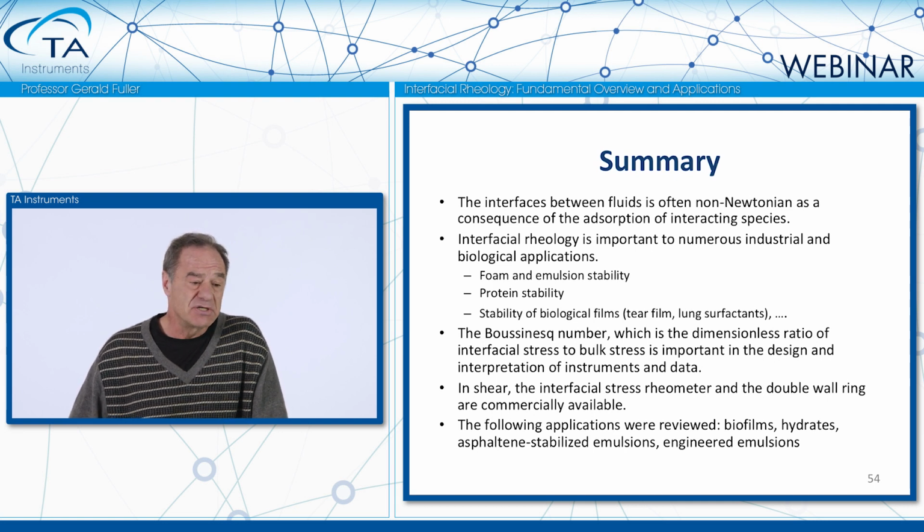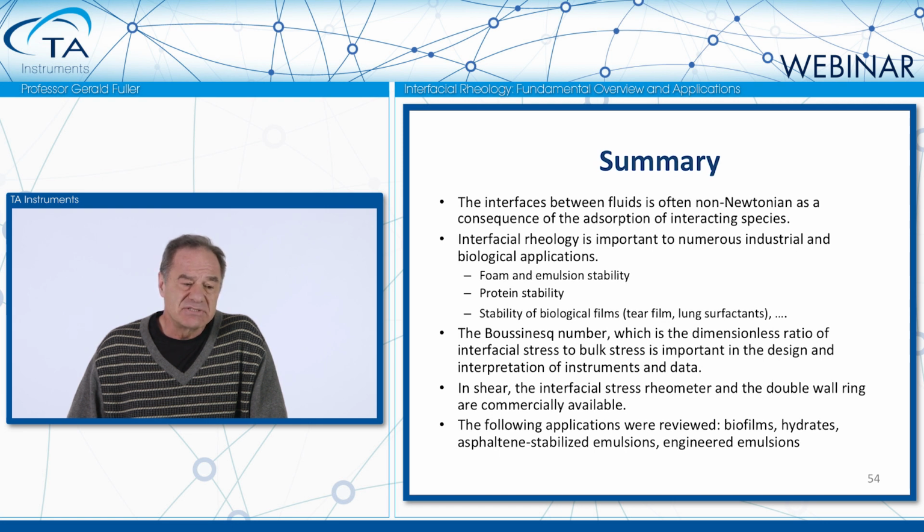You need a very sensitive one, using this patented double wall ring design from TA Instruments to do interfacial rheology. And today we looked at applications that started out with biofilms, then we turned to hydrates, interaction of oil and water, and then asphaltene-stabilized emulsions, and then finally how to engineer emulsions with different combinations of surfactants and particles. So it was my pleasure to offer this webinar to you, and I'll be happy to answer questions that you might have. Thank you very much.